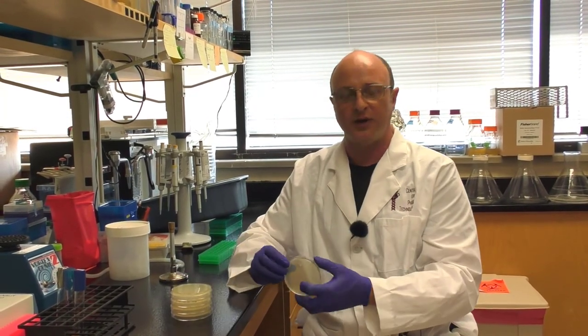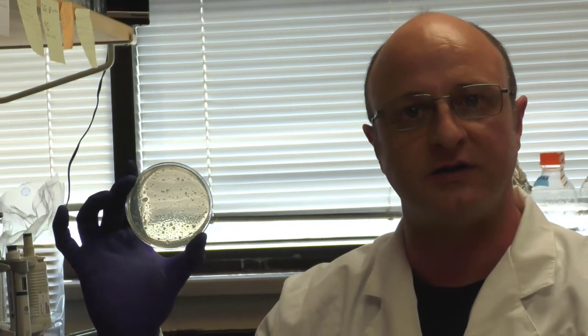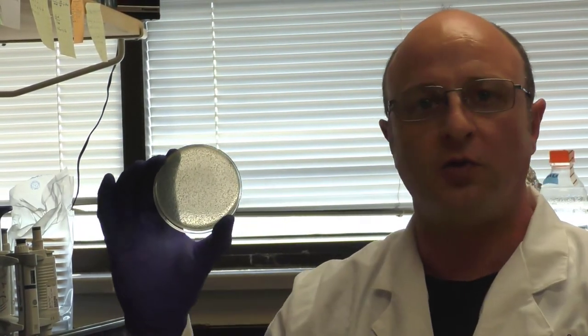So after incubation we're ready to read our results. I'm going to show you plates that were prepared by my colleague Jay Clark. He actually performed a proper experiment so we have a whole dilution series to show you. When you have far too many PFU on the plate, you'll get a plate that looks something like this. As you can see there's basically no plaques, it's actually confluently lysed. And what all of this growth is, is all resistant bacterial colonies that are growing over the surface. So this will be marked as uncountable or too numerous to count. And that was the 10 to the minus 3 dilution here. 10 to the minus 4 dilution, it's got the exact same problem. All just resistant colonies.